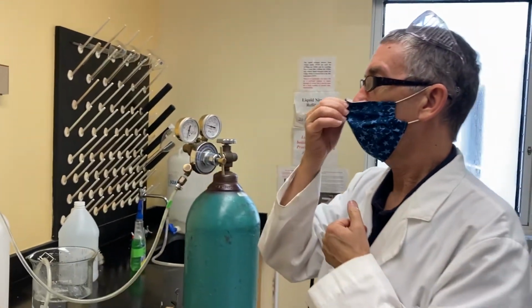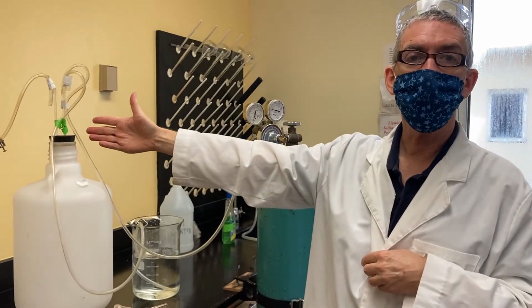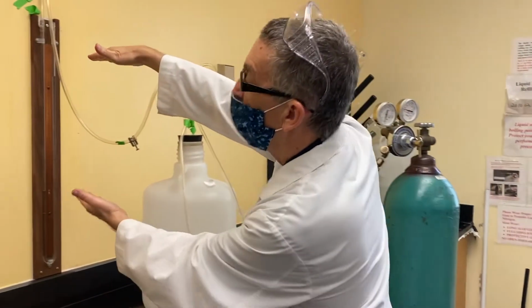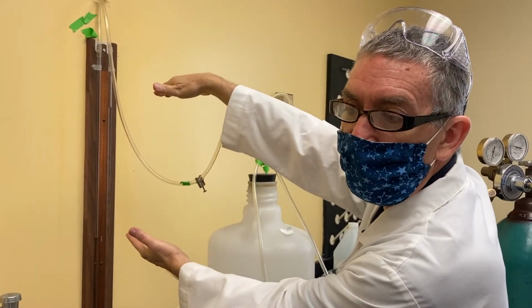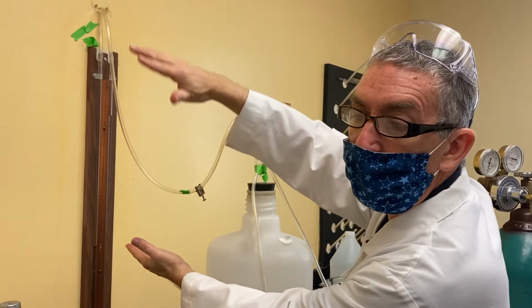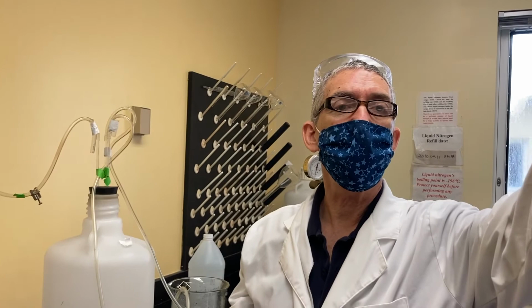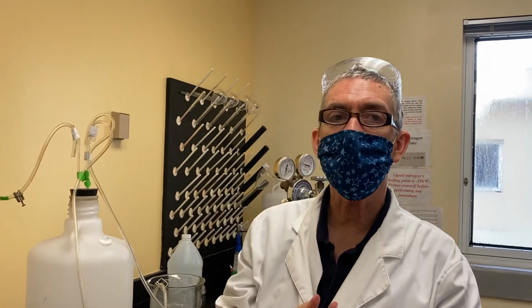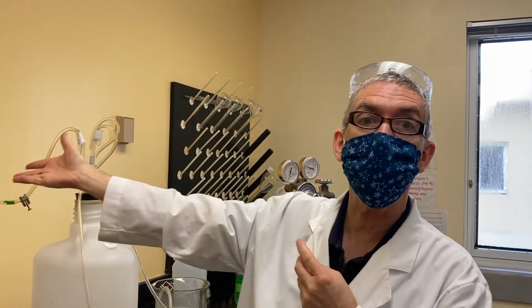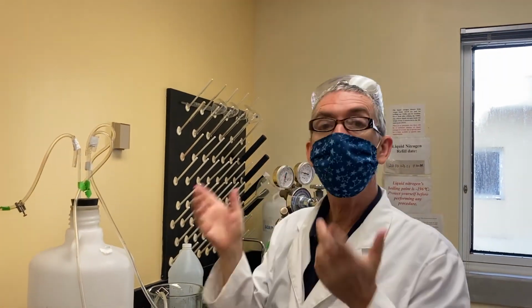Okay, so that represents P1 for your calculations. You'll take the difference in height here, convert to millimeters, then convert from dibutylphthalate to mercury millimeters using the conversion formula, and you'll have to take the difference. You'll have to include the barometric pressure in your calculation. You can think about how to do that. Do you add this to it or do you subtract that from it? You have to think about that. Okay. Then that'll be your P1.